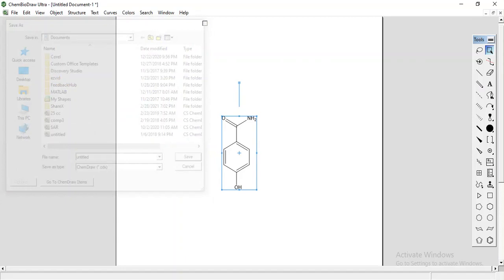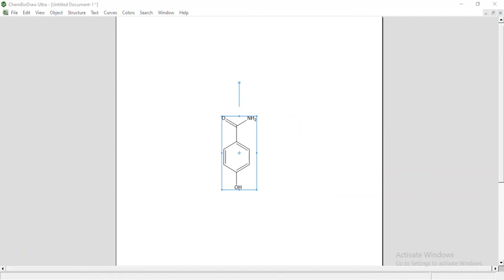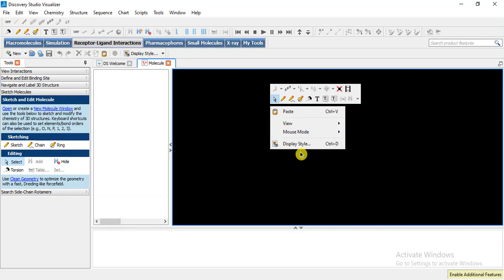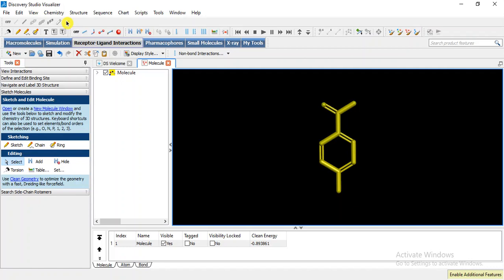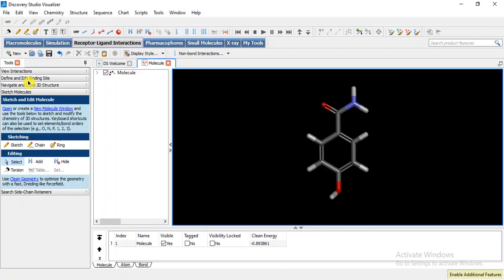So we can take it into Discovery Studio Visualizer — I have made tutorials for this software. Paste the structure here; we can add hydrogens or skip that step. Then we can save it as a SMILES file.